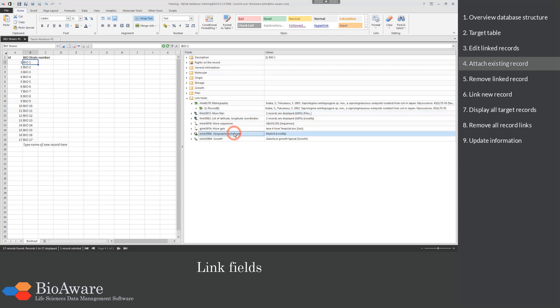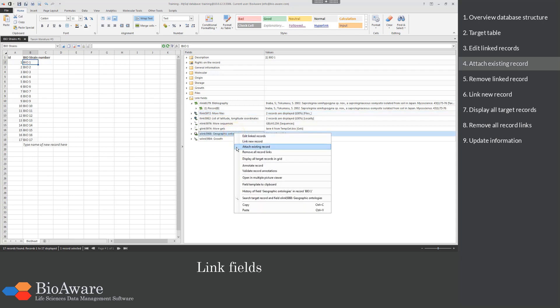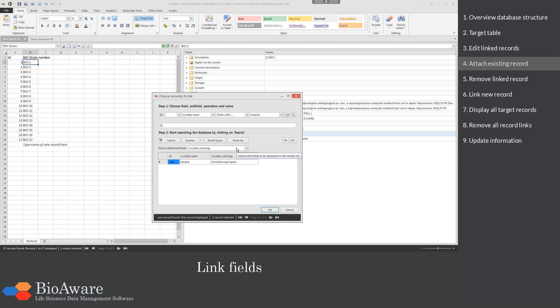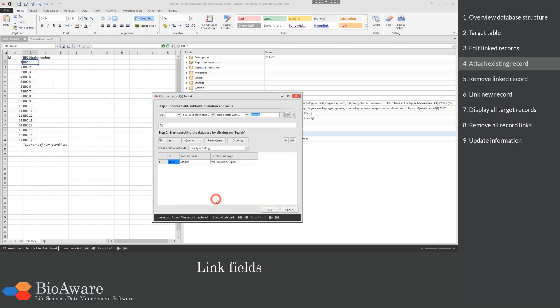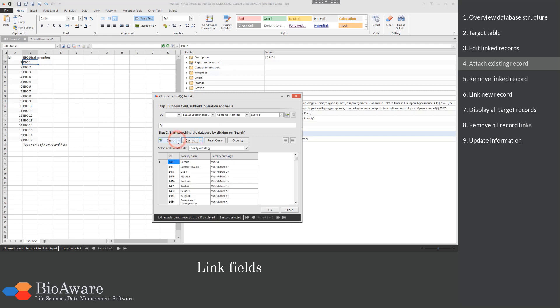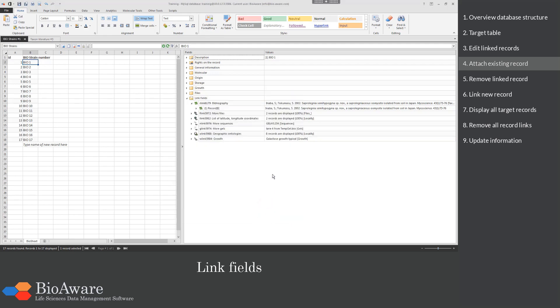For the Ontology link field I will attach more existing records. I will use the search option to find all records belonging to Europe. Select the records to be linked and click OK. As you can see, 8 records are now linked.